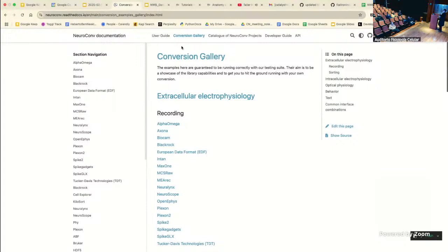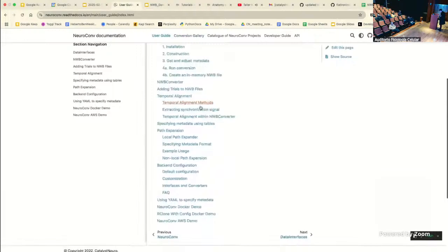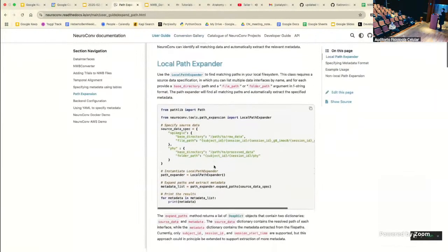We do provide some tools that I can show you that will allow you to do that programmatically to some degree. You can find this tool here, where you pass a format of how you usually organize your data, and it allows you to iterate over that structure. But that's one more degree of complexity. So we provide help, but we cannot automate it for that reason.